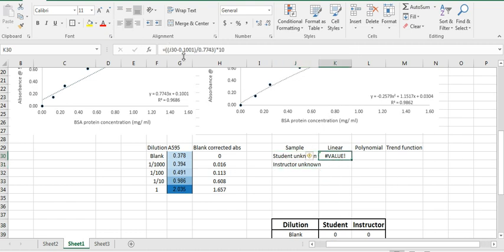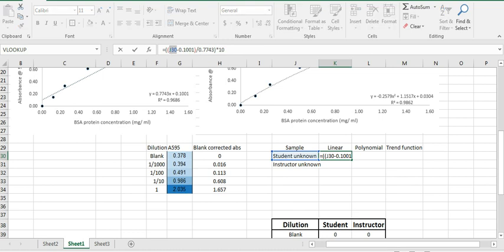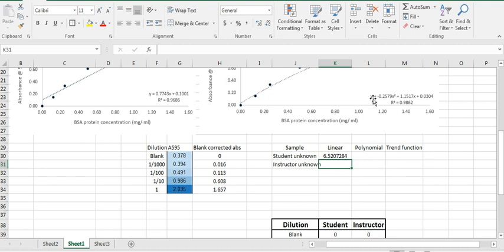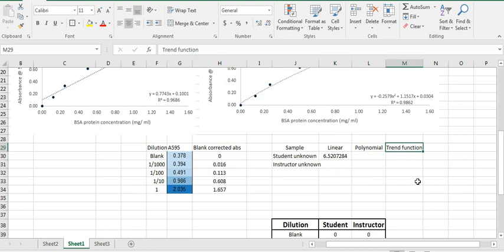giving the different values for the numbers that you need to do. So here, this was 0.605, so I'll just fill that in. You're going to have the quantification of protein using the linear trend line, the quantification of protein using the polynomial trend line equation, and then the third column will have the quantification of protein using the combined curve that I have provided you.